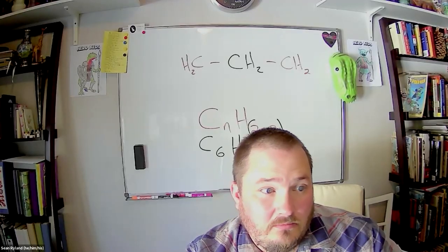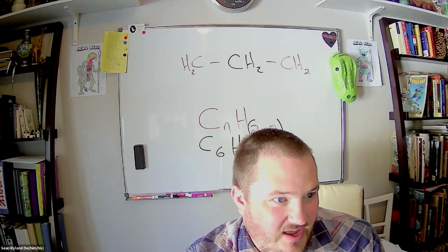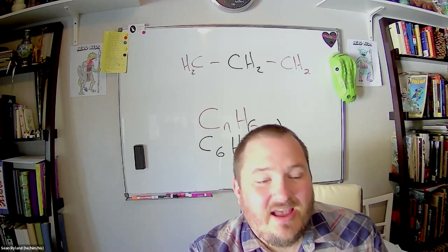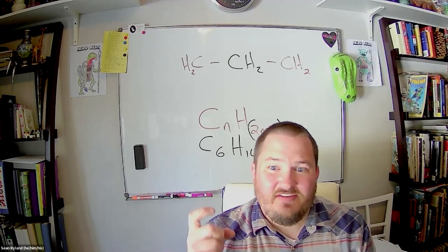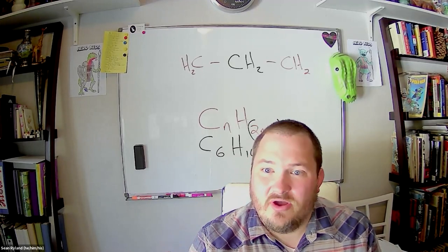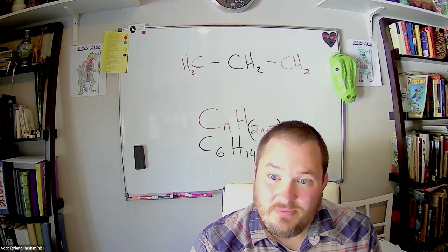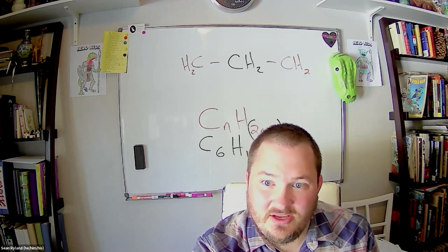So a couple of things. One, since we know that this is something that has an alcohol in it, alcohols, when you have oxygens, instead of having a carbon-carbon bond between them, you have a carbon-oxygen bond, they don't couple as well. So you don't always see any peak splitting if it's an alcohol peak. If it's an alcohol proton, you might not see any peak splitting.